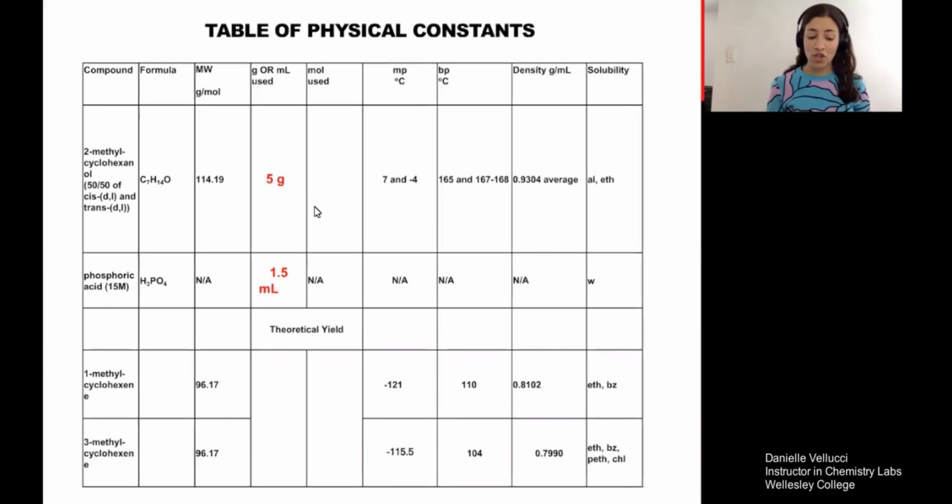Now, of course, we do not know what ratio to expect for these two alkene products. That's why we're carrying out the experiment. But we know that they have the same molecular weight, so the overall yield of product is predictable.